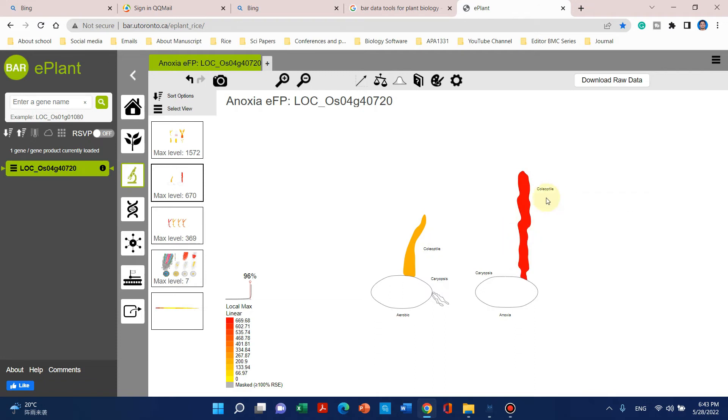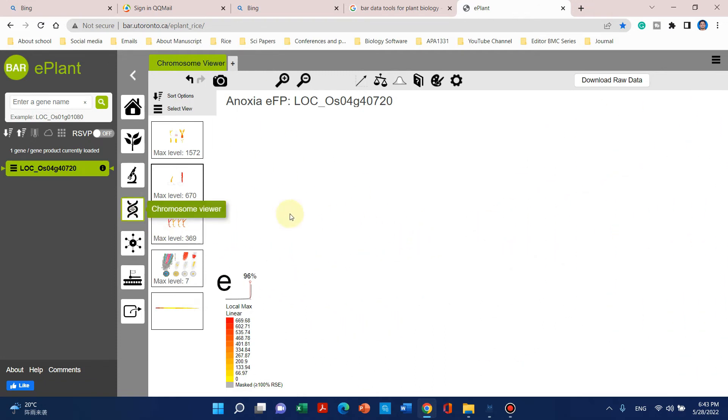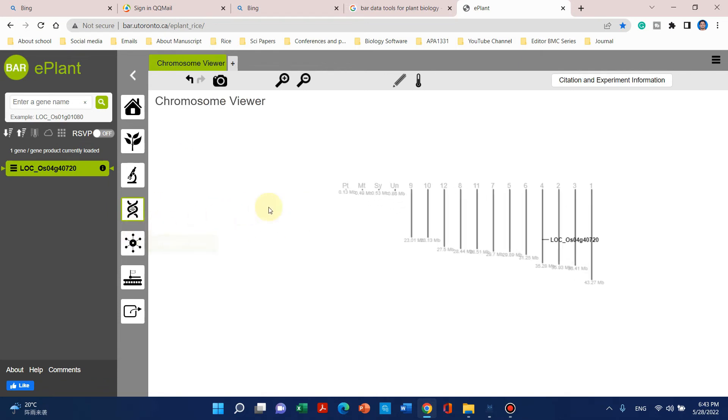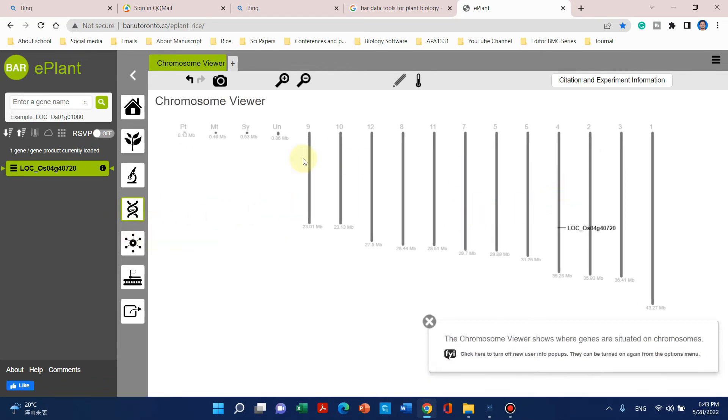We can also see its location on the chromosome. Rice has 12 chromosomes, and this gene is located on chromosome 4.